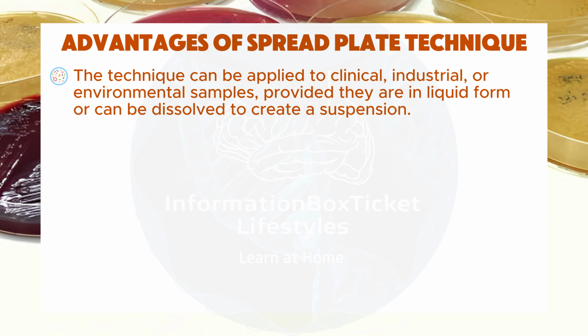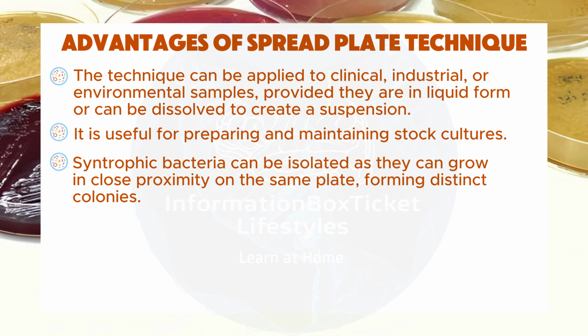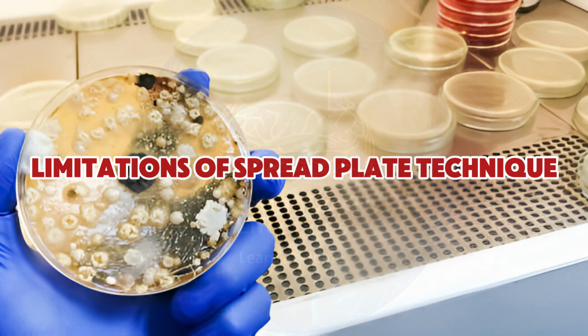The technique can be applied to clinical, industrial, or environmental samples, provided they are in liquid form or can be dissolved to create a suspension. It is useful for preparing and maintaining stock cultures. It is especially effective for culturing aerobic microorganisms. Syntrophic bacteria can be isolated as they can grow in close proximity on the same plate, forming distinct colonies. There is minimal risk of contamination when using sterile glass beads as spreaders, as the process is conducted with the culture plate lid closed.